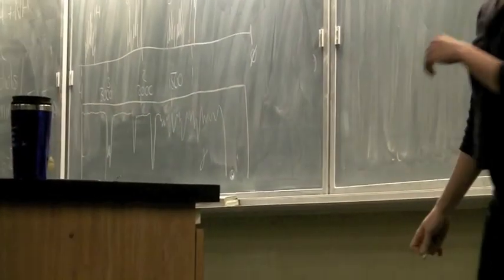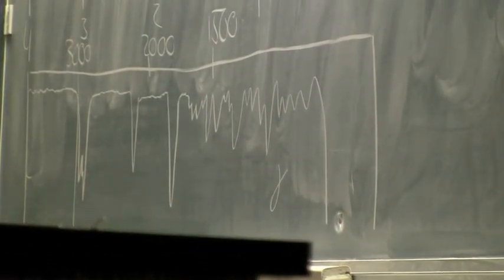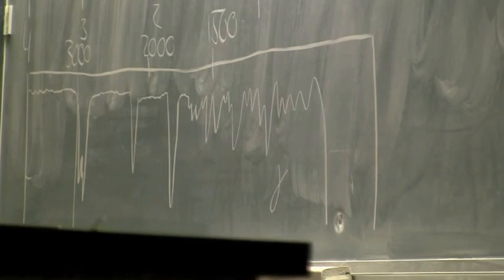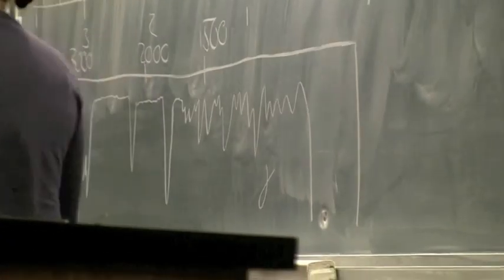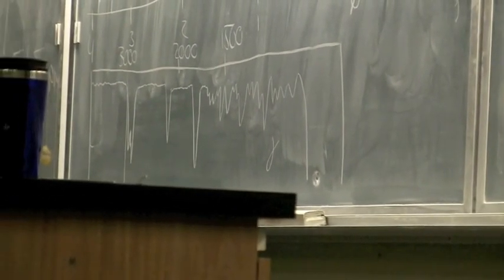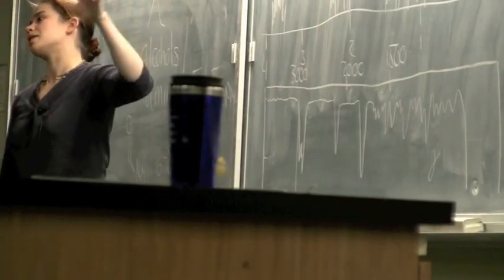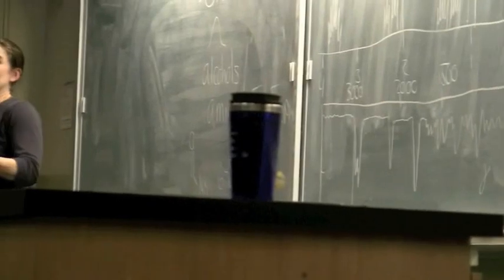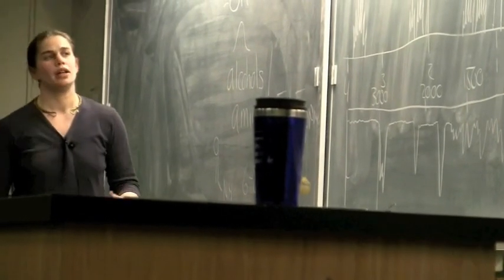So, how do we want to go about doing this? The trick with these is you want to sit down and be somewhat logical about it. I tend to take a very straightforward approach to each individual peak as I'm coming up to it. Some folks like to write tables. Some folks like to pick one peak and go to the next. I tend to work left to right on my spectrum, because it means I don't lose anything. If you like to look at the one you get, then the next one you get, that'll work just fine.